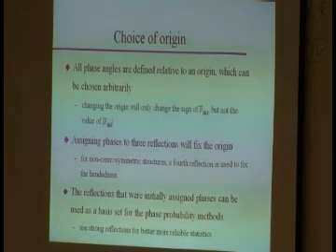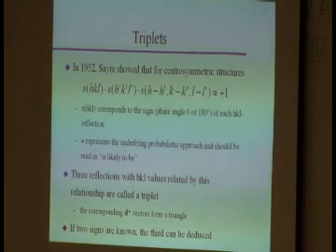You then use this initial set of reflections as a basis set for your probability methods. Okay, that is what the computer does. So usually it uses very strong reflections for the initial phase choices, because that just gives you some more reliable statistics. What does the computer then use? It uses something called triplets.